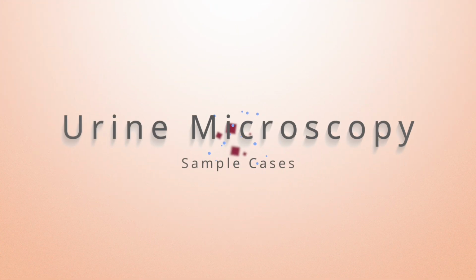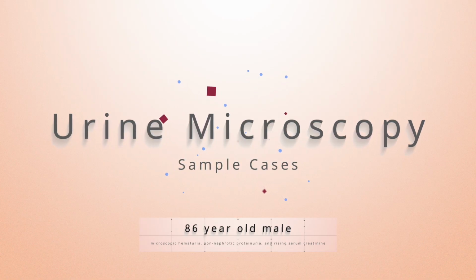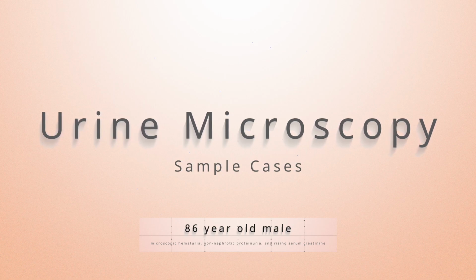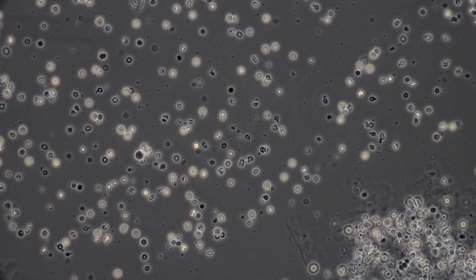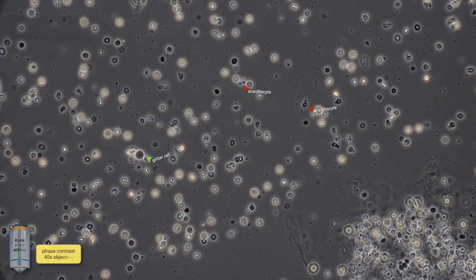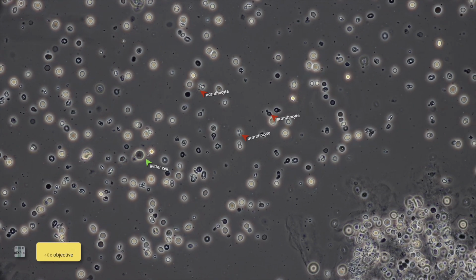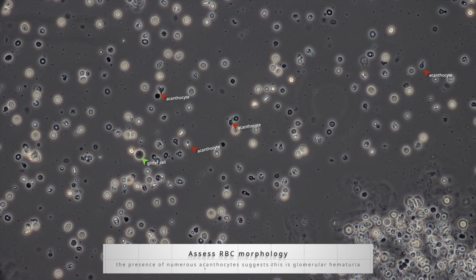Now let's look at a few sample cases. The first is an 86-year-old male patient who presents with microscopic hematuria, non-nephrotic proteinuria, and a rising serum creatinine. Since in this case he has microscopic hematuria, we'll start by looking at phase contrast here with the 40x objective to look for the presence of dysmorphic red blood cells or acanthocytes.